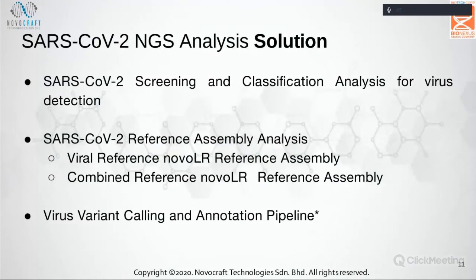So we developed the solution, which is a SARS-CoV-2 NGS pipeline powered by the novoWorx platform. novoWorx is an easy-to-use platform that has already been in the market for a couple of years. This platform provides a lot of flexibility across different NGS studies.